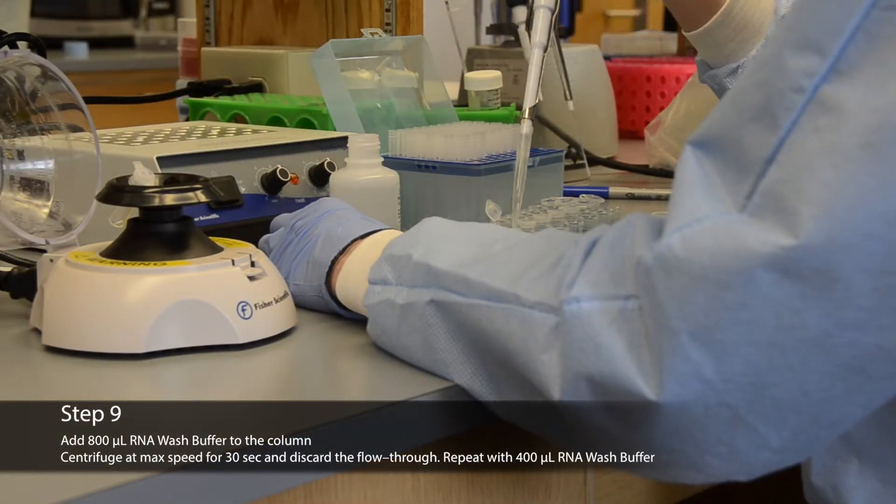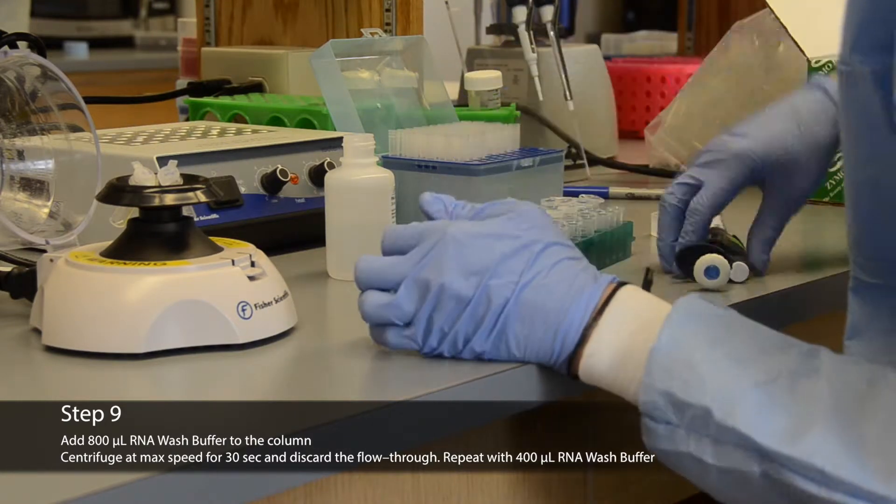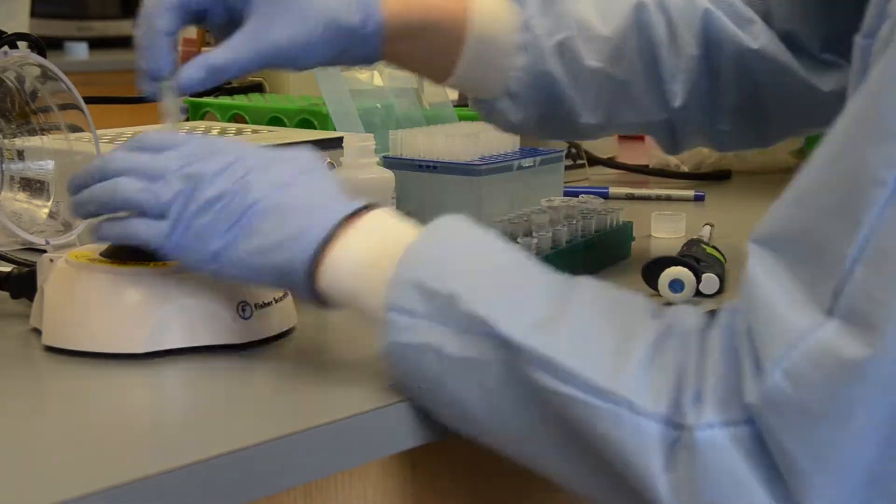Add 800 microliters RNA wash buffer to the column and centrifuge at max speed for 30 seconds. Discard the flow through. Repeat with 400 microliters of the RNA wash buffer.